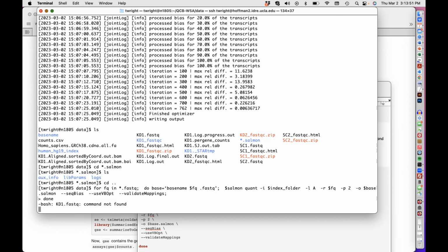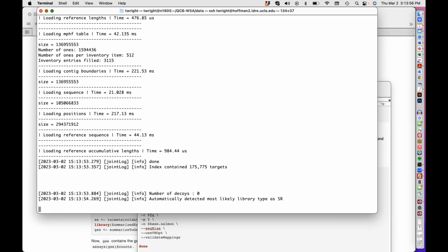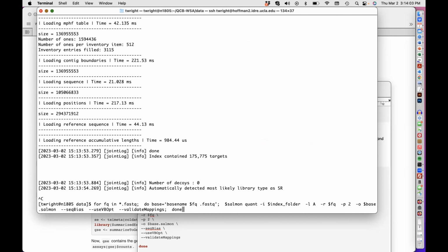Okay, it's the same. Okay, press enter again, and then press up again. So I have to change the quotes. Yep, yeah, the quotes there. I've changed the preferences on my text editor to not have smart quotes, so I might be making progress.